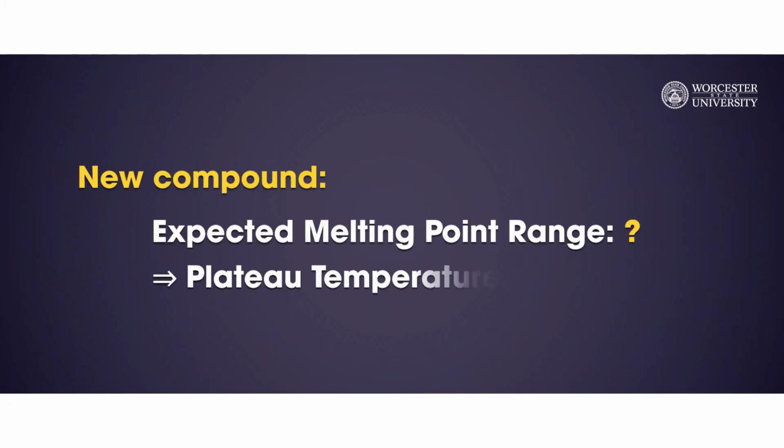We can set up the plateau temperature if we have at least a general idea of what our sample is. However, what if it is a new compound and we don't know its theoretical melting point range? We have a special strategy to solve this problem.